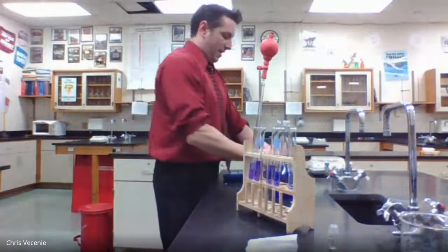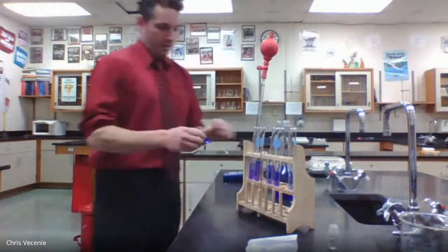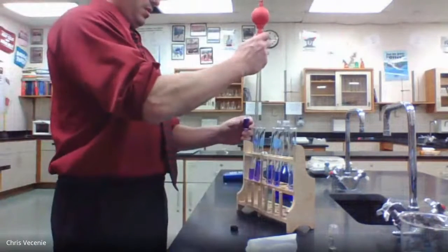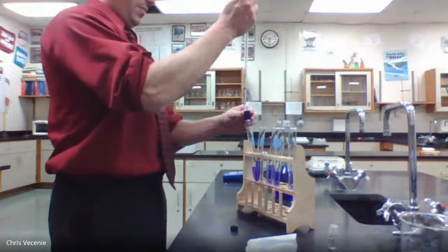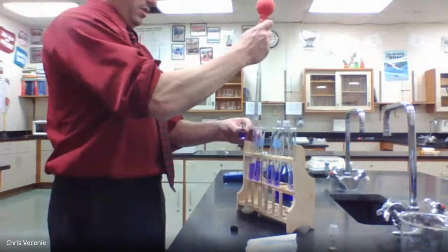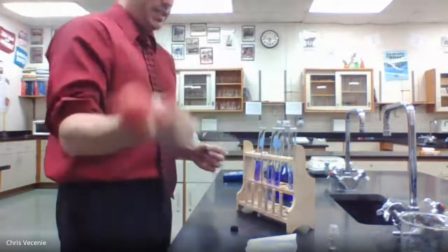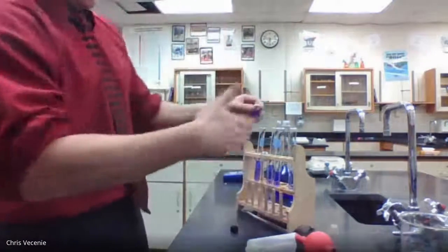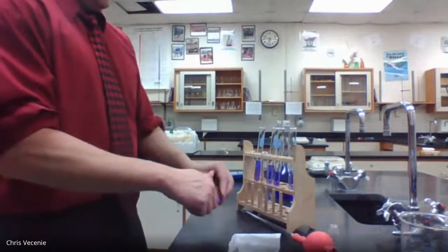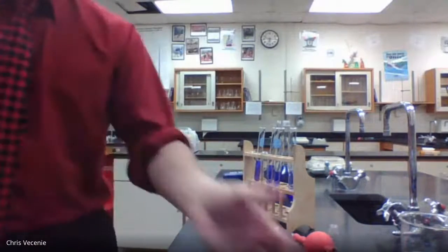All right, then I'd take that one out. Empty them back out into here. And you would simply repeat the process for each of the following 5. We go through that, and that's going to allow us to build our Beers-Lambert plot. So let me show you what that part's going to be like.